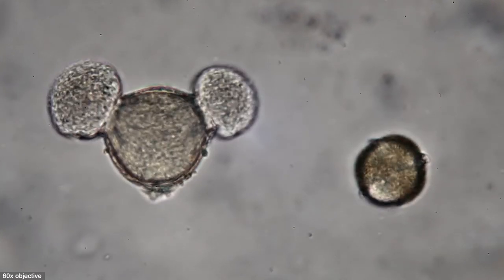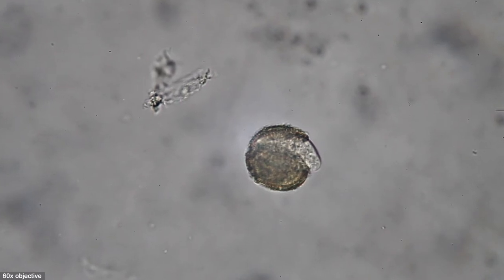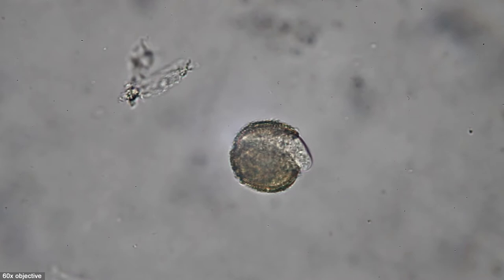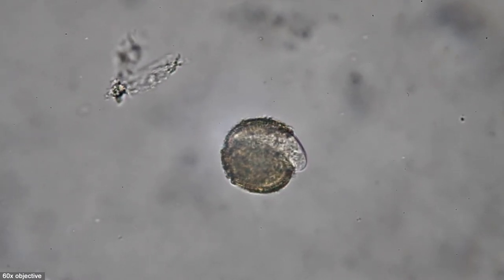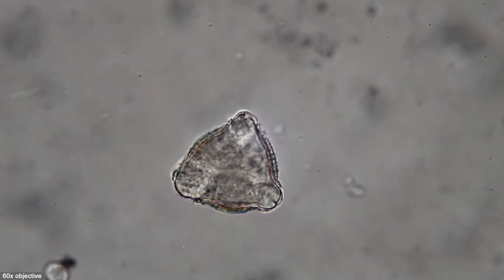So there were quite a lot of these pollen in the water drop. And this one, I don't know, seemed to have already popped open. Maybe it's starting to form a so-called pollen tube. I'm not sure about that. But so maybe the pollen tube starts to grow ready to fertilize the plant.